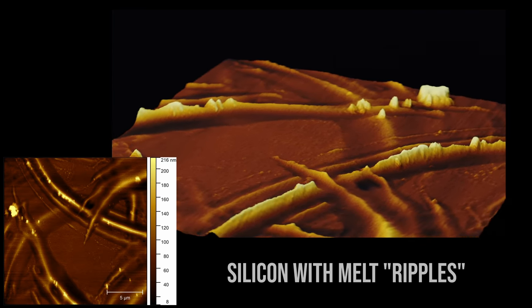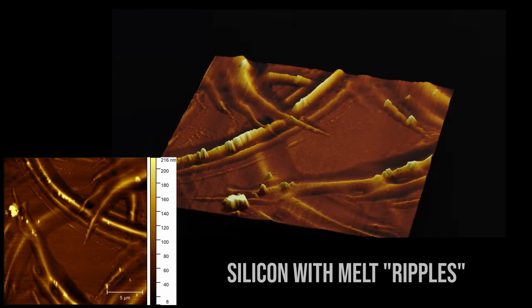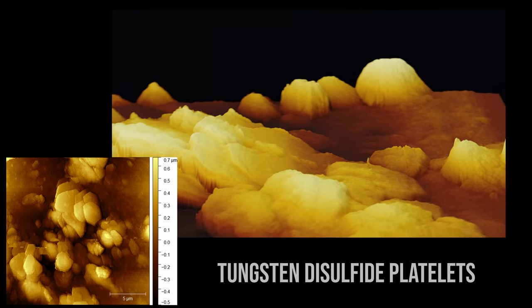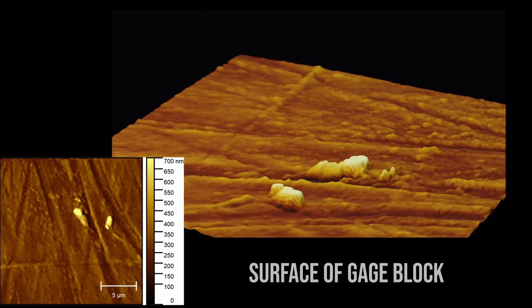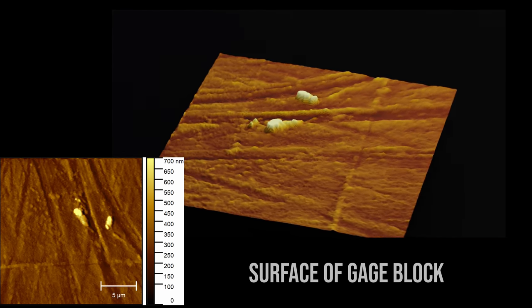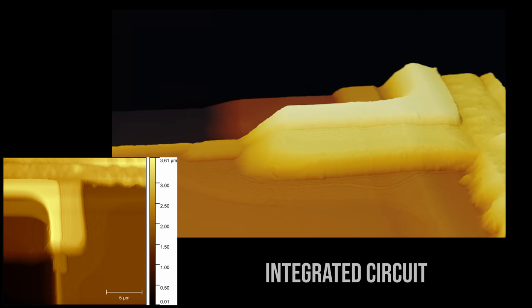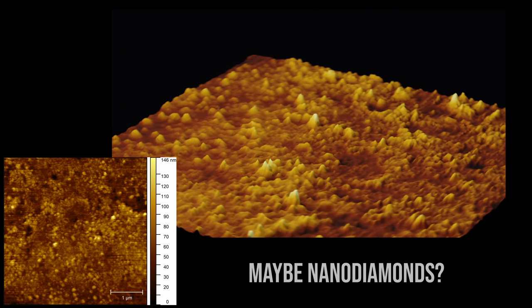This is the surface of a silicon wafer that has been partially melted with a laser, so you can see some melt ripples. These are some tungsten disulfide microplatelets — it's a van der Waals material, sort of like graphite. Here is the surface of a precision ground gauge block. This is part of an integrated circuit from 1979. And these may or may not be nanodiamonds — the jury's still out on this one.